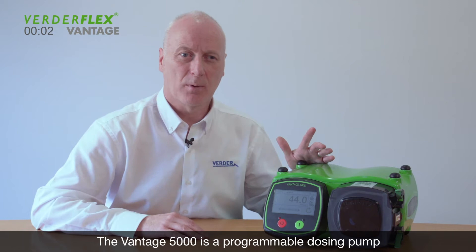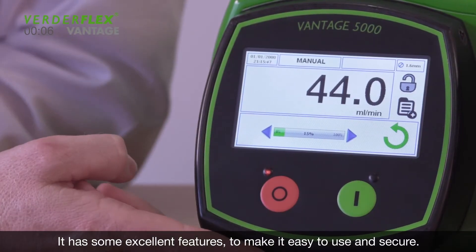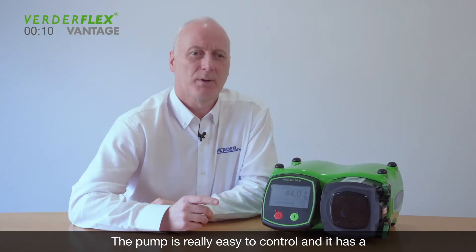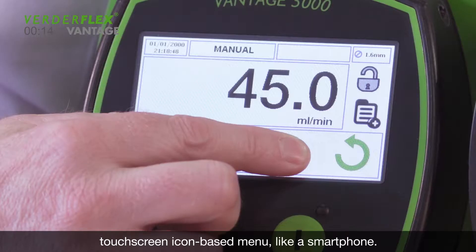The Vantage 5000 is a programmable dosing pump for use in the lab and on the shop floor. It has some excellent features to make it easy to use and secure. The pump is really easy to control and it has a touchscreen icon-based menu like a smartphone.